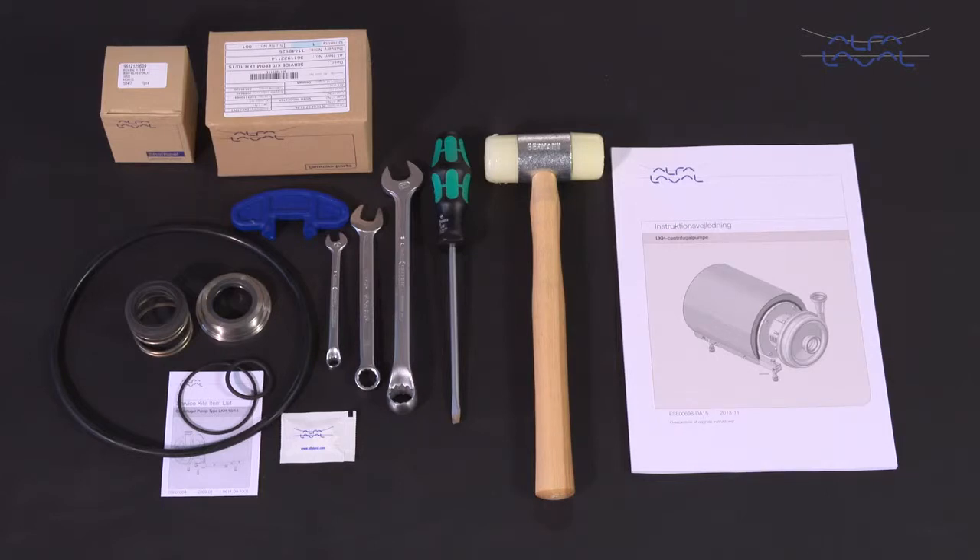Remember, always read the instruction manual thoroughly to cover all maintenance steps, since this video only shows you some of the steps. To maintain the standard Alfa Laval LKH centrifugal pump range, these tools are required. Each Alfa Laval service kit contains all the spare parts you need.